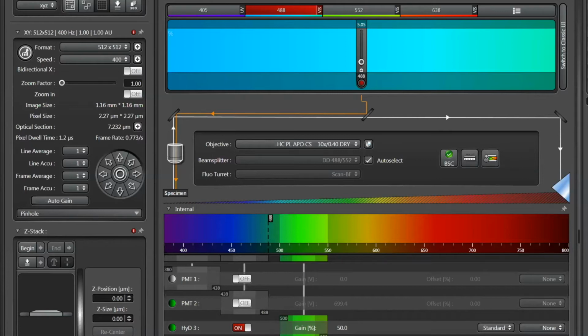You go from 512 to 1024, it takes 4 times as long per scan, right? It's actually only twice as long. Oh, it does only twice. So the scan speed here is the number of lines per second that we're reading.